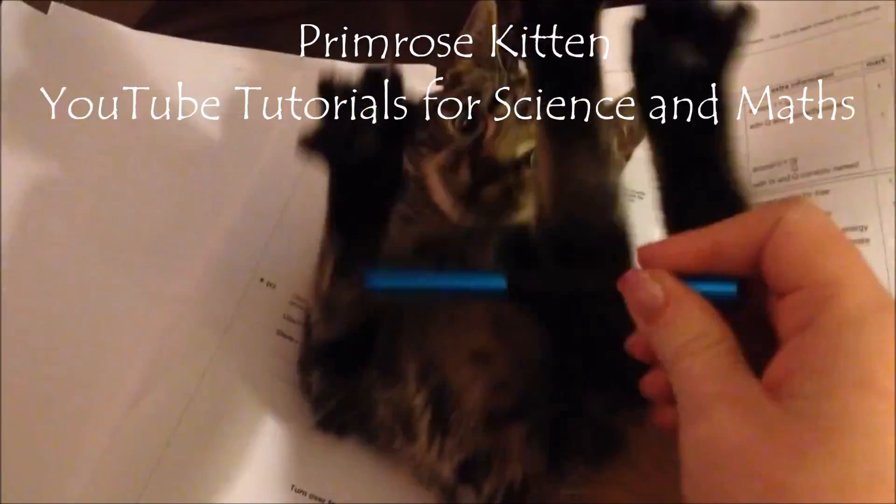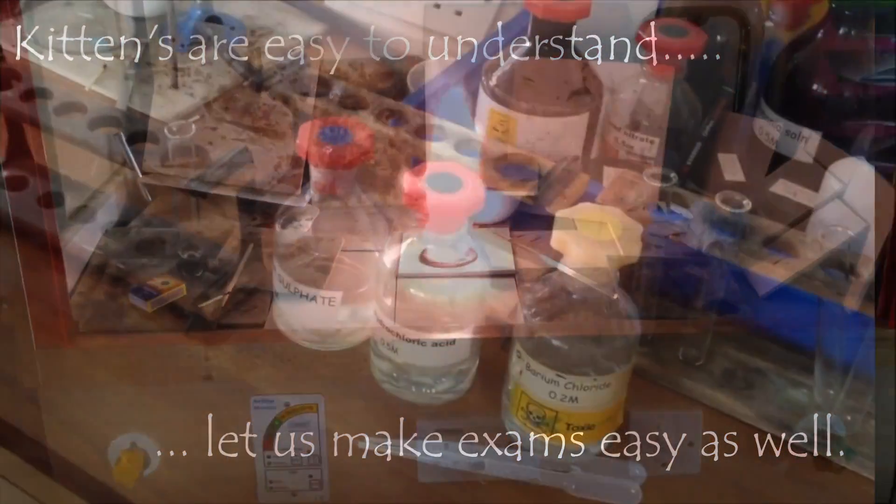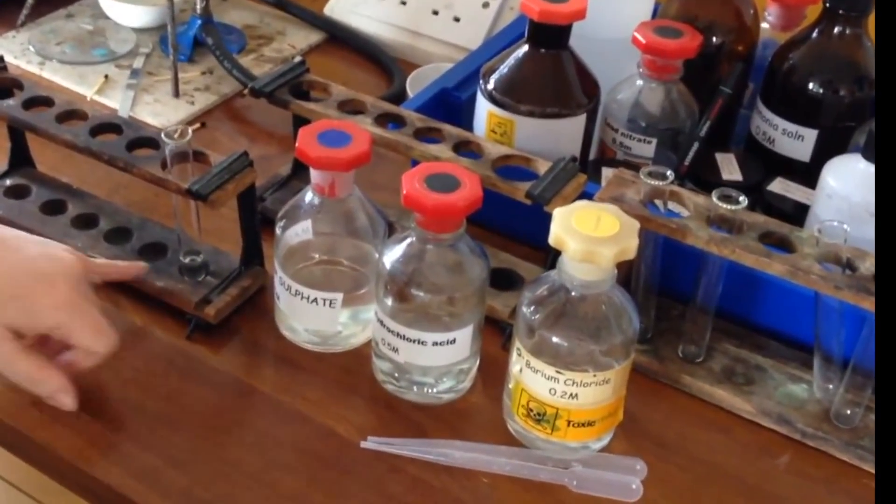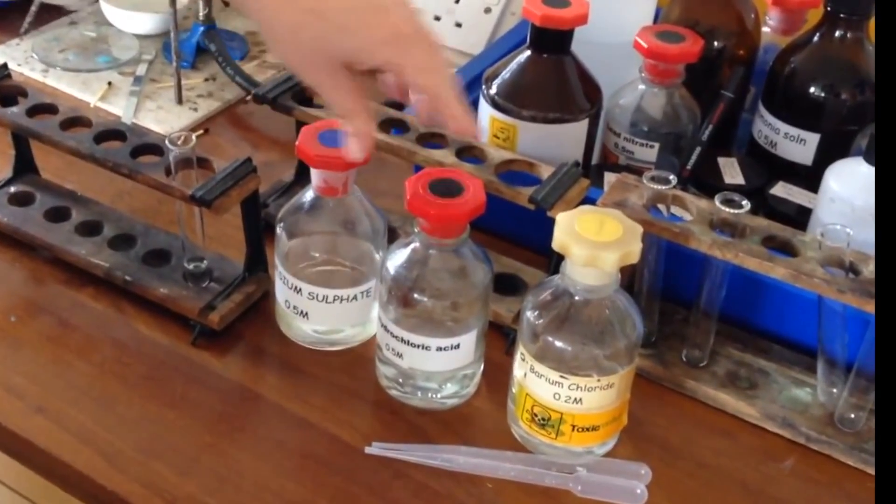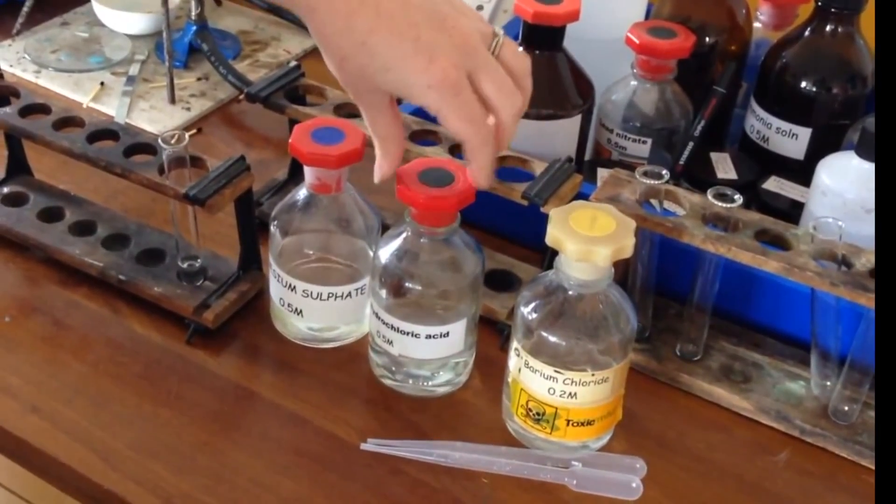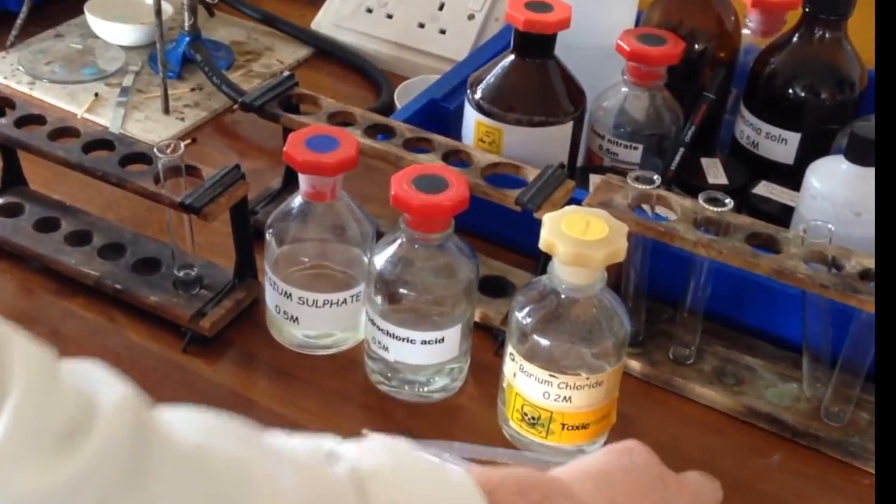Hey guys, in this video we're going to be going over how you test for sulfate ions. In here I have some magnesium sulfate. I'm going to add in sequentially hydrochloric acid and barium chloride.